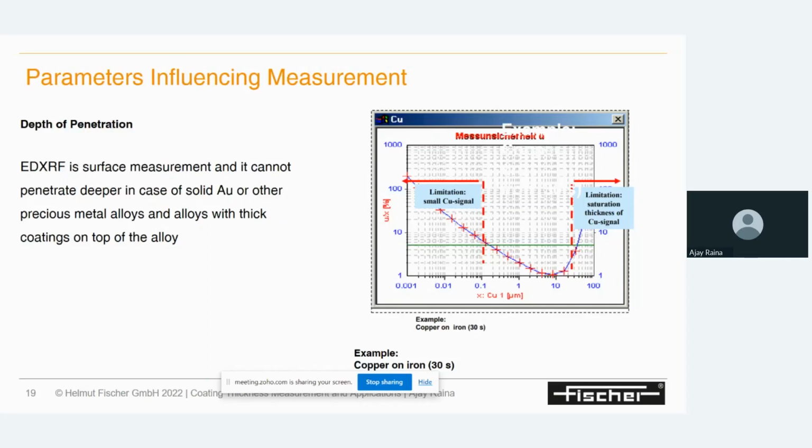And mostly, depending on the coating and coating material, we can give you the exact information about the sample penetration limit, or sample saturation thickness, and how much the signal can penetrate.